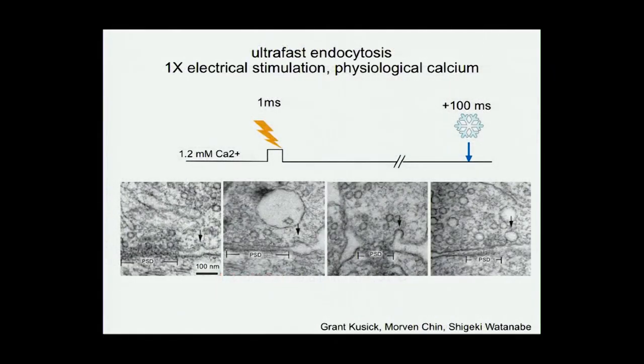So what about ultrafast endocytosis? Now what we've done is we stimulate once, with a 1 millisecond pulse, and then we freeze 100 milliseconds later.